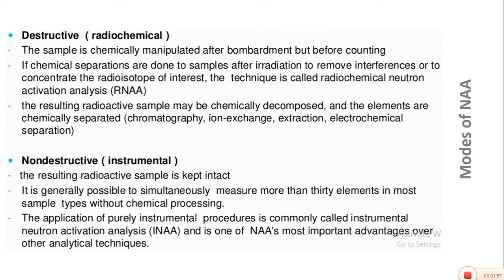The other main kind of analysis, which is very important and commonly used in neutron activation analysis, is the non-destructive process. This is another way, also known as instrumental analysis. The resulting radioactive sample is kept intact. It is generally possible to simultaneously measure more than 30 elements in most sample types without chemical processing.